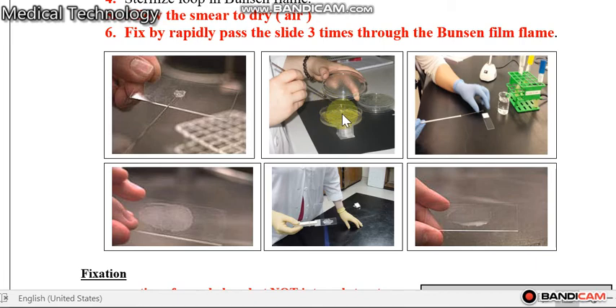Transfer the bacteria to the slide and mix the bacteria with the distilled water — with the drop of distilled water. First, take one drop of distilled water and put it on the slide, then re-sterilize the loop. After that, take a small piece of the isolated colony and mix it well with the distilled water.